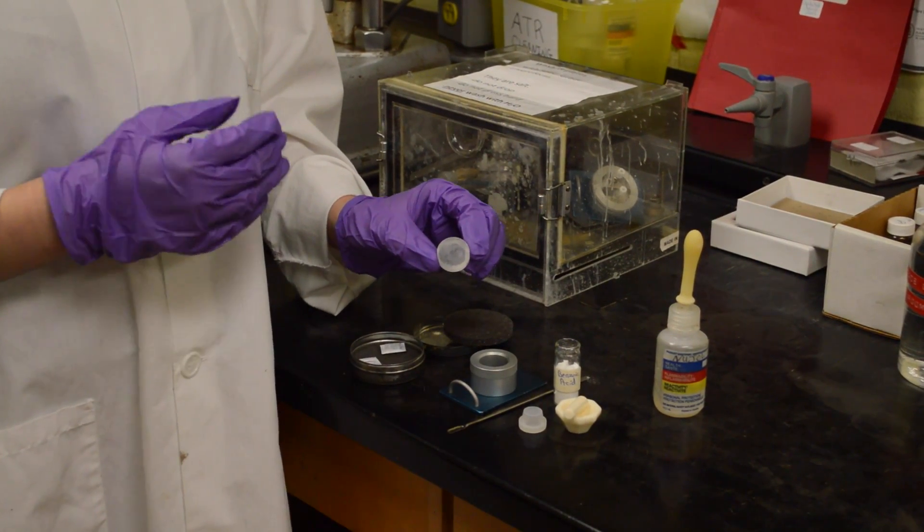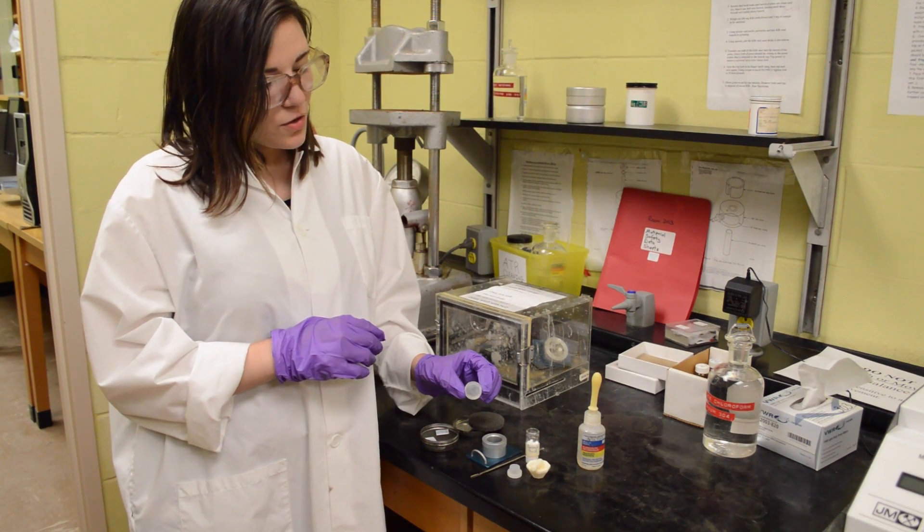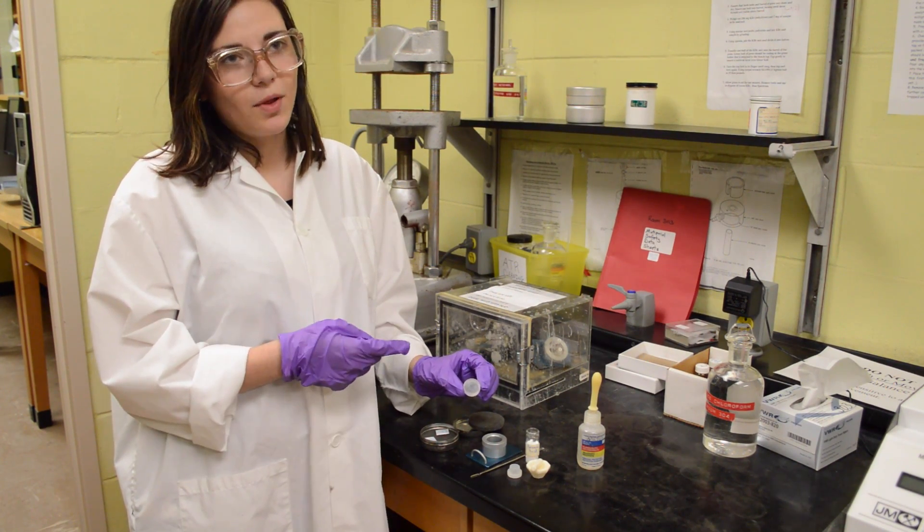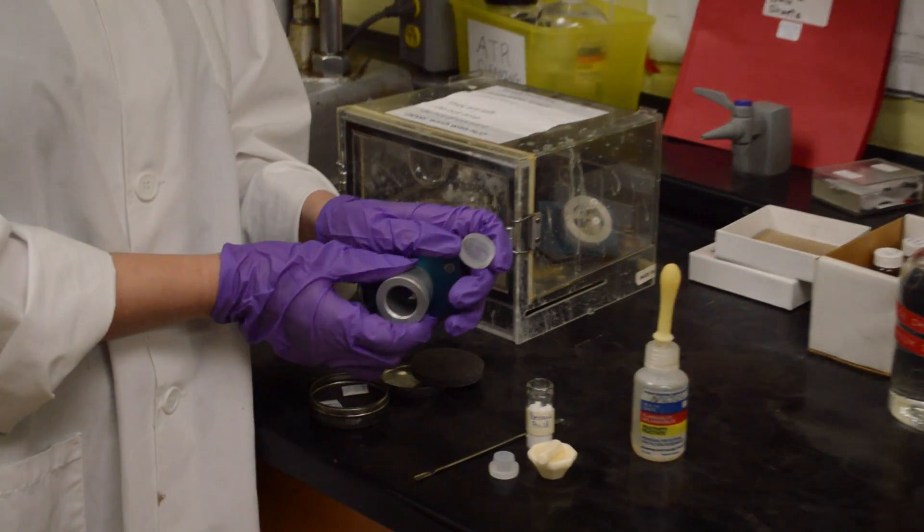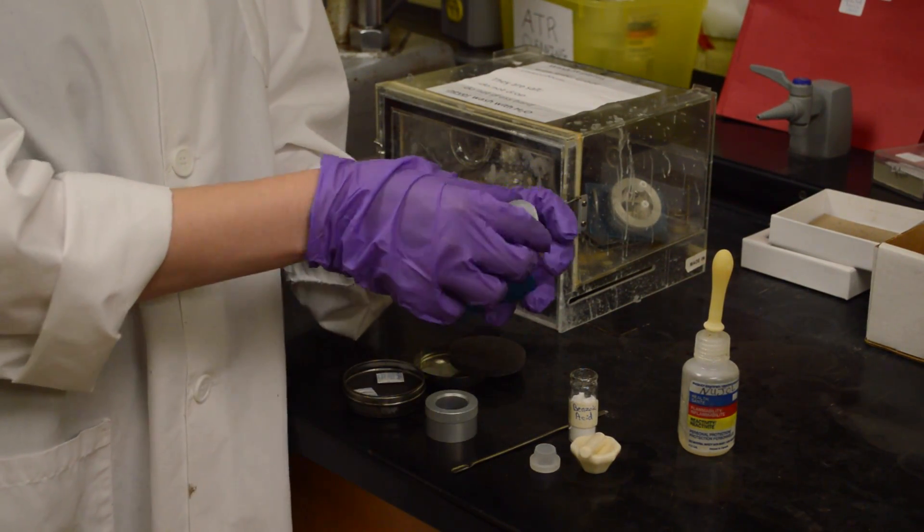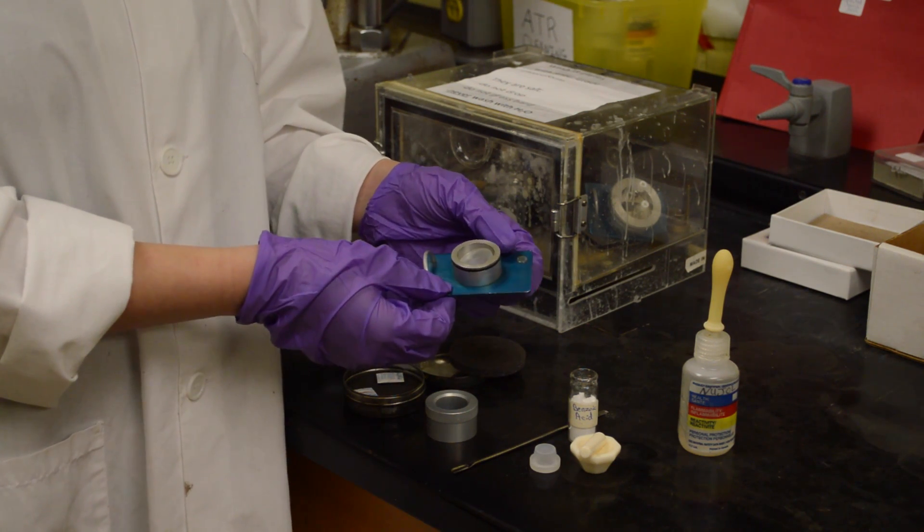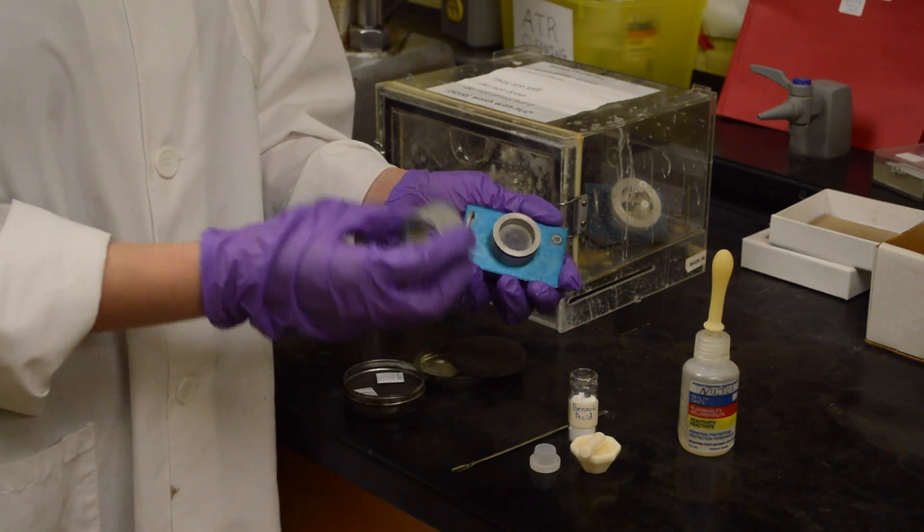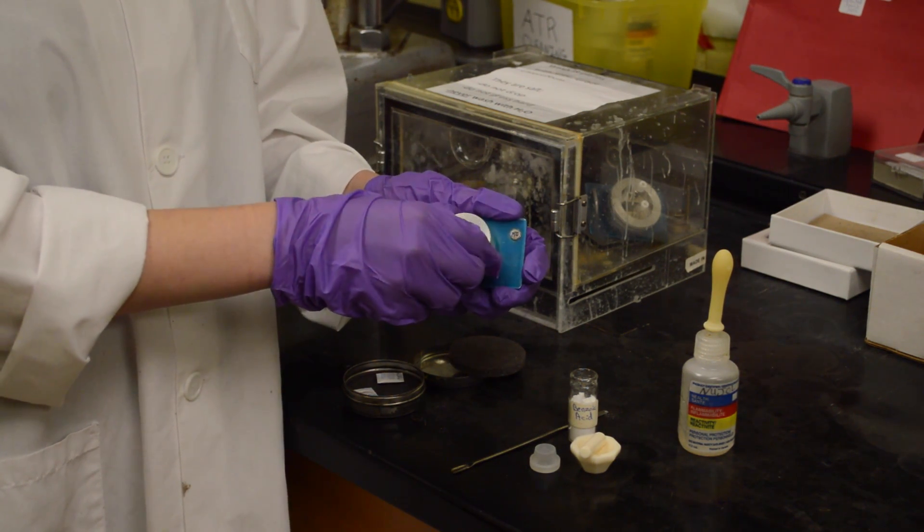Now if you have a pure liquid sample, so not something in solution, a pure liquid sample, you would directly apply that liquid sample onto the plates. The plates then go in the holder like so. The top part comes right off, and then you can just plop the plates in carefully. Flatten them out, and then gently put this back on top. And your sample is ready.